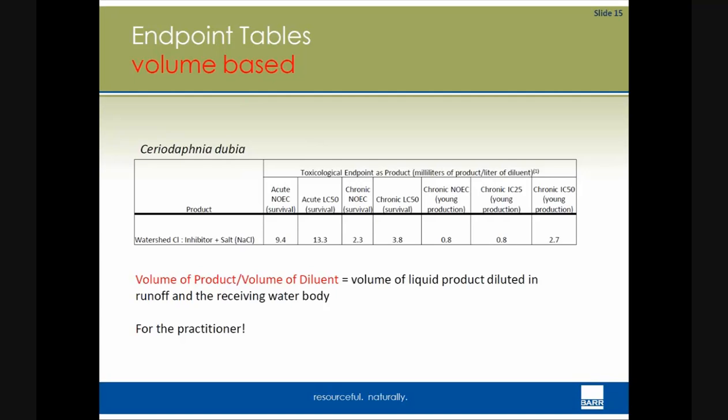Again, these kinds of things can be evaluated by taking the inhibitor or the product and doing your testing with the actual receiving water body. If there's some curiosity about doing that type of experiment, it's done all the time for compliance testing for municipal and industrial facilities, where they actually have to take the receiving water body and use that as part of their dilution series. So it's not uncommonly done, and it can be determined what the impact is, but it's not known at this time.